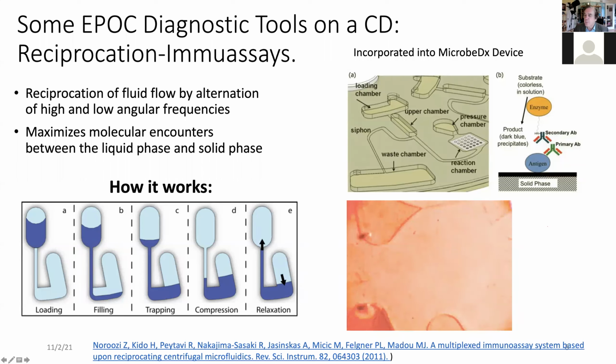Now, what I want to illustrate to you is a very important aspect of microfluidics. If you have a sensor like this array and you send liquid over it, you go from the center towards the rim. The liquid that's here at the rim, it's gone, right? It goes to waste, to this waste chamber here. But suppose your test isn't done, you want that liquid back.